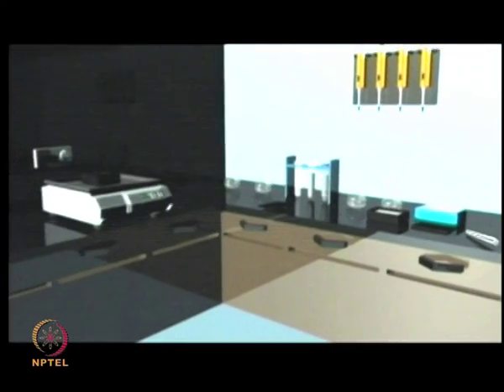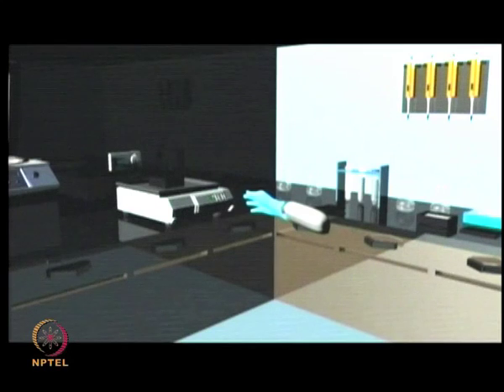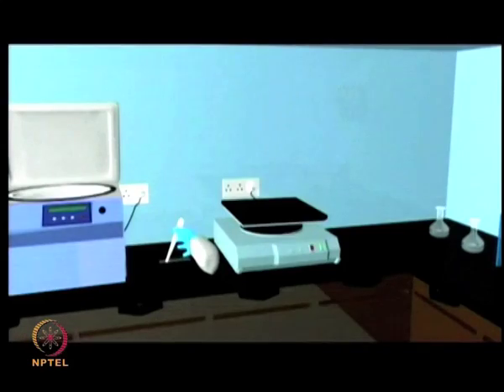In the microarray experiment, one needs to ensure proper washing and gentle shaking throughout various steps to ensure that the slides are washed very neatly. Otherwise, you will see very high background on the slides.